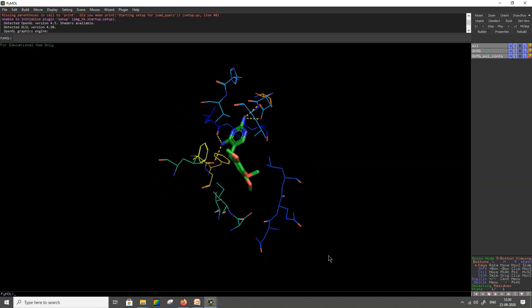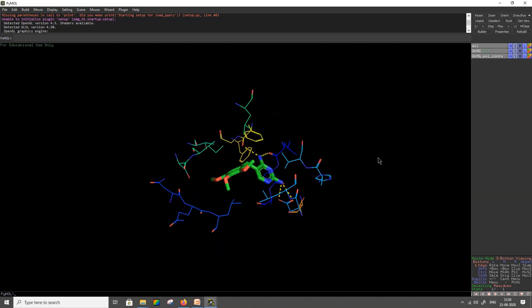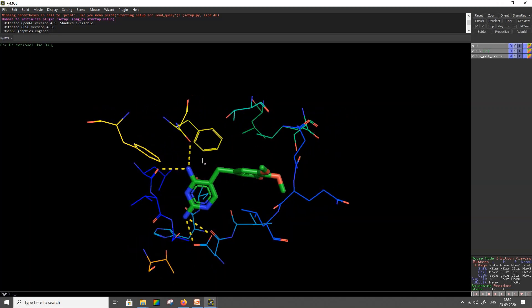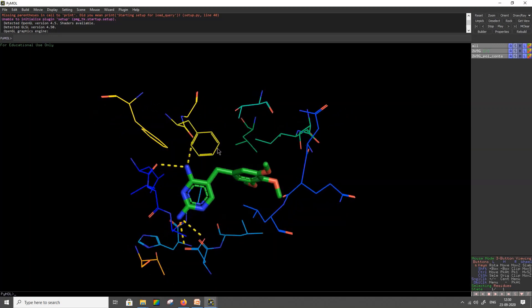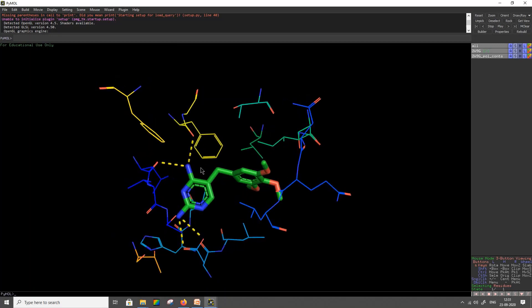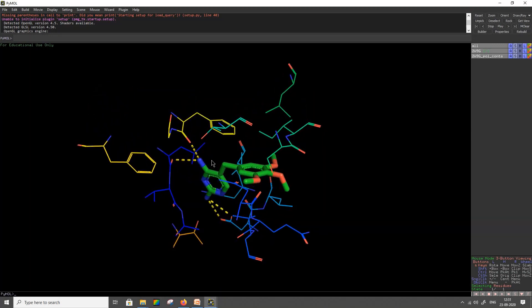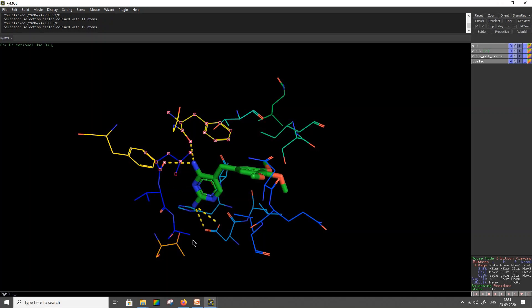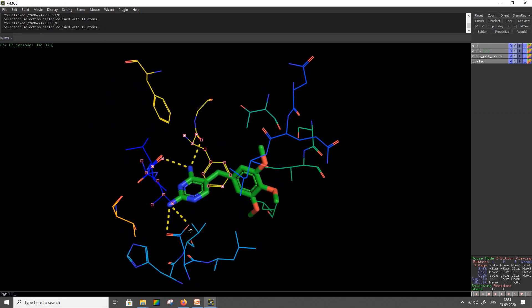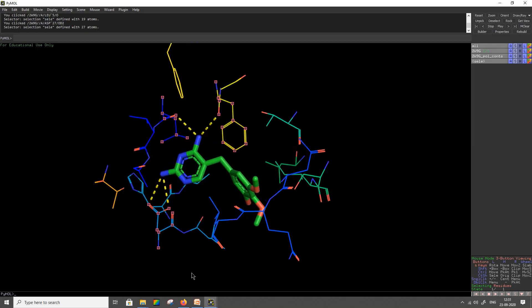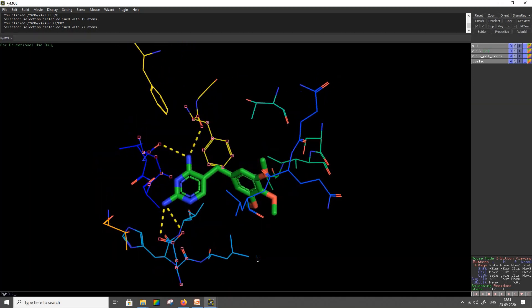The next step is to compartmentalize the polar and non-polar interactions. For this, you have to select the polar and non-polar interactions individually. These yellow dashed lines that you are observing between the ligand and the amino acid are hydrogen bonds. To separate out the polar interactions, click on the atom that is connecting these dotted lines. Similarly, click on all the atoms that are connecting the yellow dashed lines — basically all the atoms involved in hydrogen bond formation. Here we are seeing four hydrogen bonds formed by three residues.